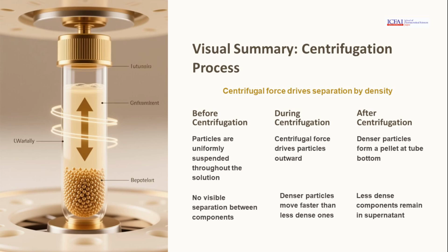Here's a visual summary of the centrifugation process. Before centrifugation, particles are uniformly suspended. During centrifugation, centrifugal force drives particles outward, and after centrifugation, denser particles form a pellet at the tube bottom while less dense components remain in the supernatant.